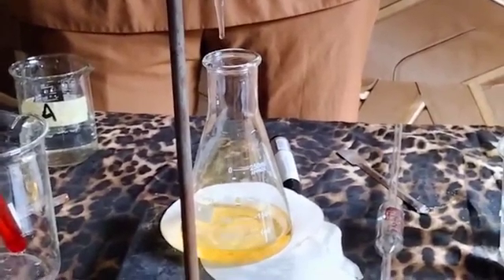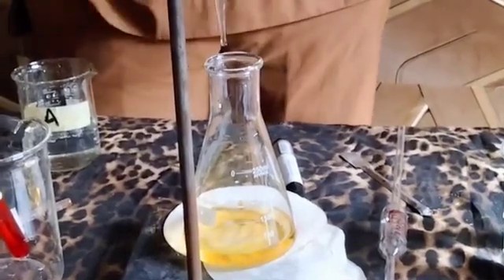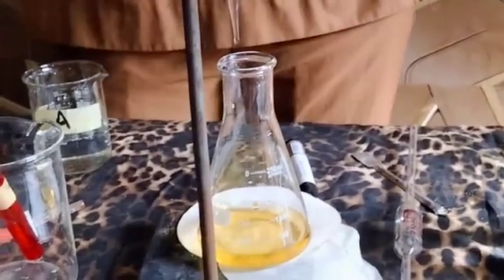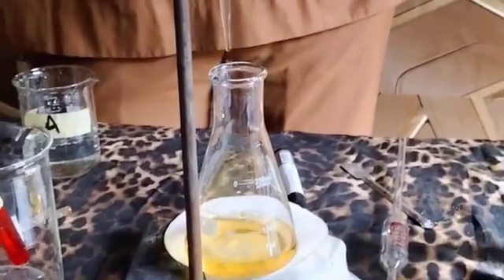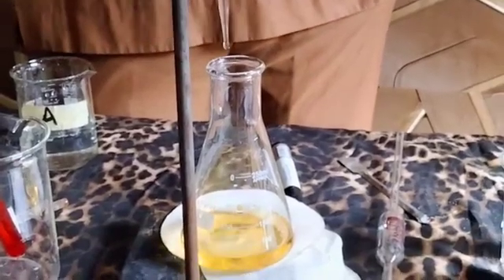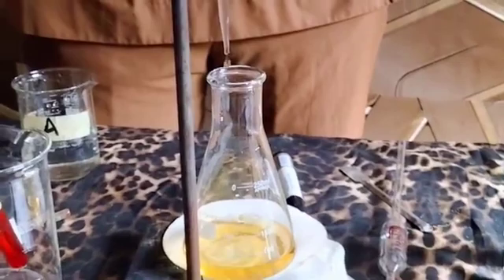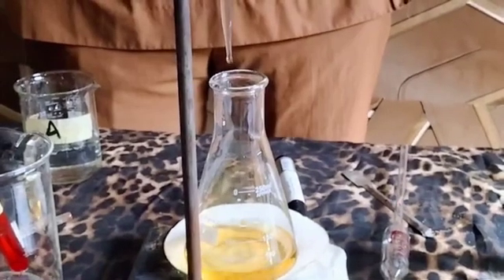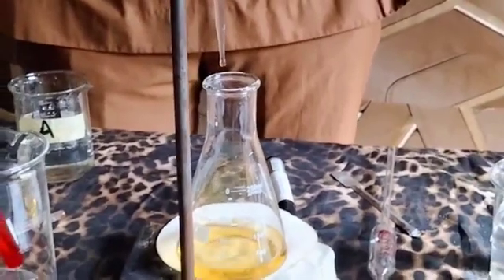So I'm watching the color as well as watching the burette reading. And then your main focus should be on the color and not on the burette reading. You observe the color on the conical flask. So you see yellow as we continue to move it and see going drop by drop. You see you have to take some patience so that you know when the color changes.